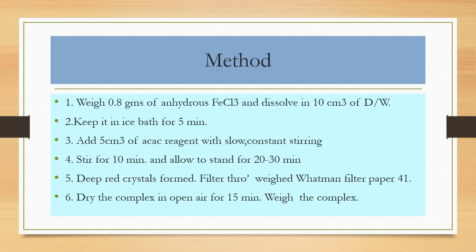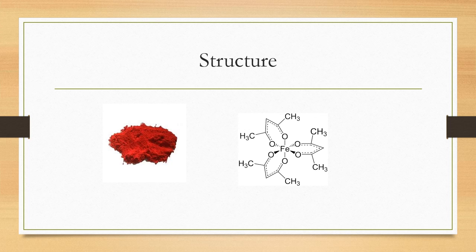For filtration, we are using Whatman filter paper 41. So filtration is carried out through Whatman filter paper 41, and of course the complex is dried in open air for 15 to 20 minutes, and then the weight of the complex is taken. Look at the image of the product, which is a bright red colored complex, and this complex is very stable.